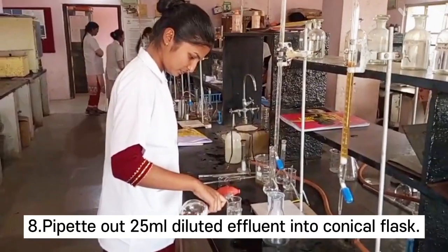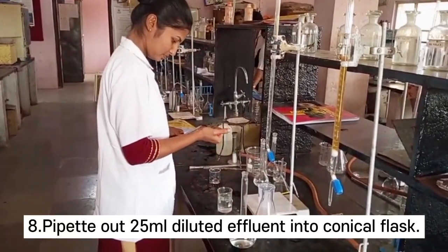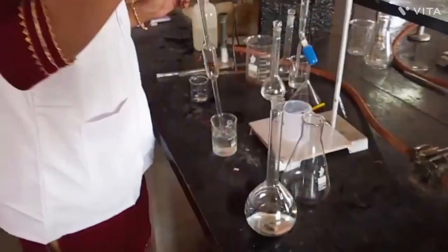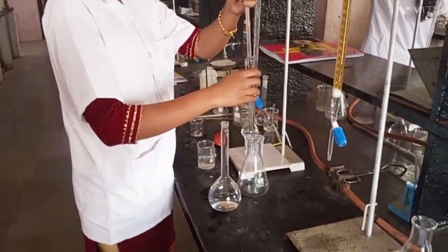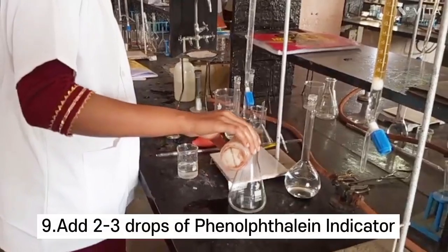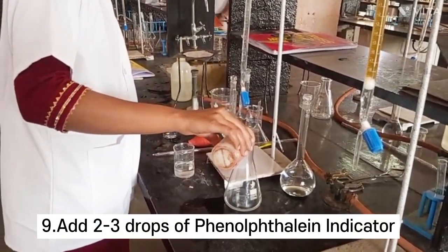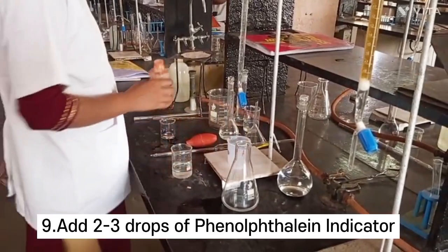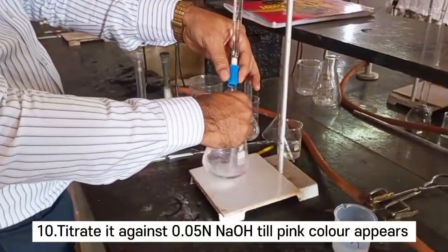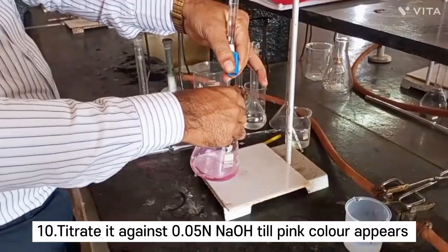Pipette out the diluted collected effluent into a conical flask. Pipette out 25 ml of the diluted effluent. Add 2 to 3 drops of phenolphthalein indicator to the content and titrate it against 0.05 normal NaOH until a permanent pink color appears.